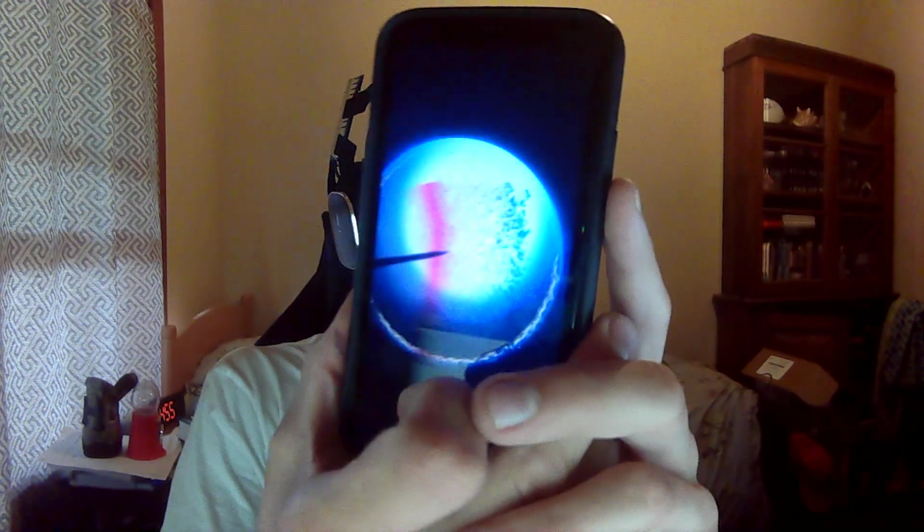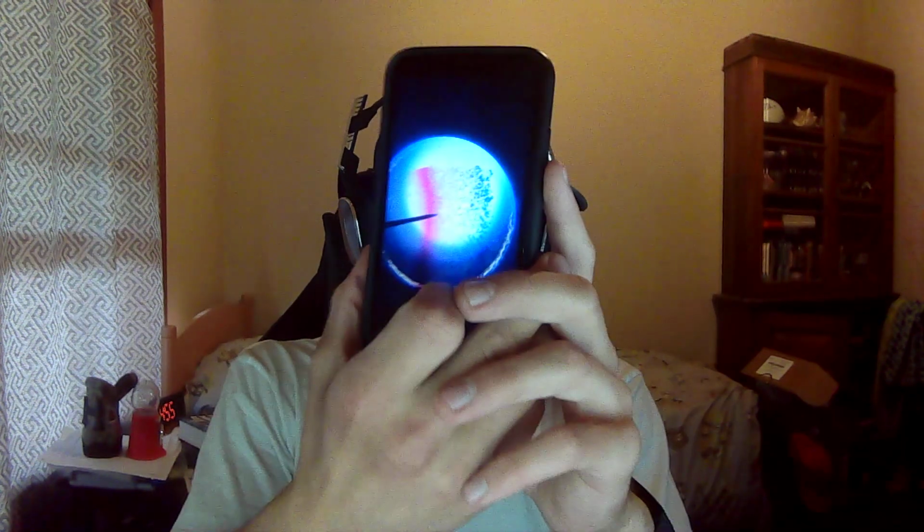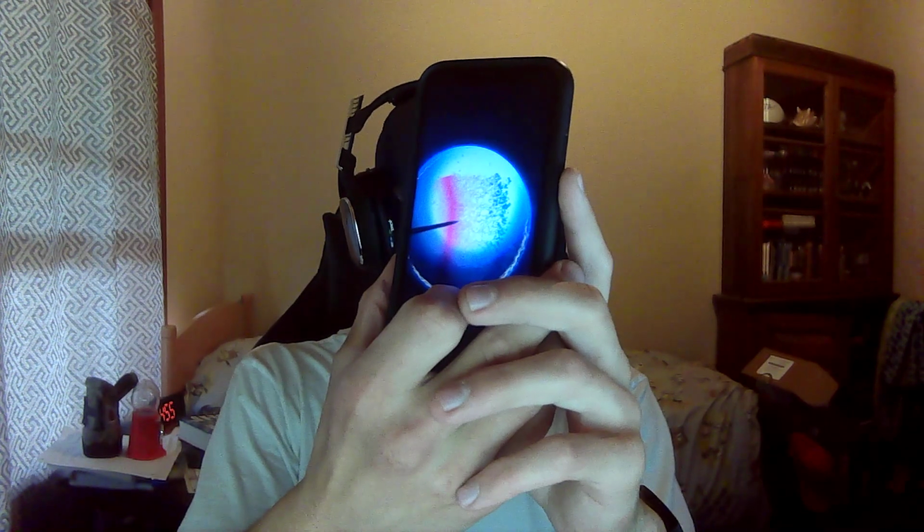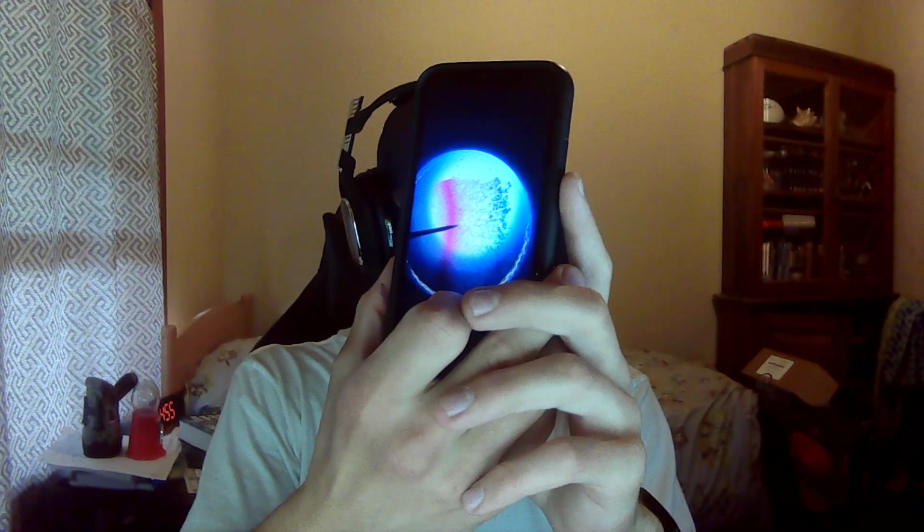Now moving on to the penicillin. Here's the penicillin. Moving back, trying to make it easier. As you can see, the penicillin is a very cool looking slide. It looks like some kind of graphic novel. The color shifts from a pink to a light purple to a violet. I thought it was really cool.